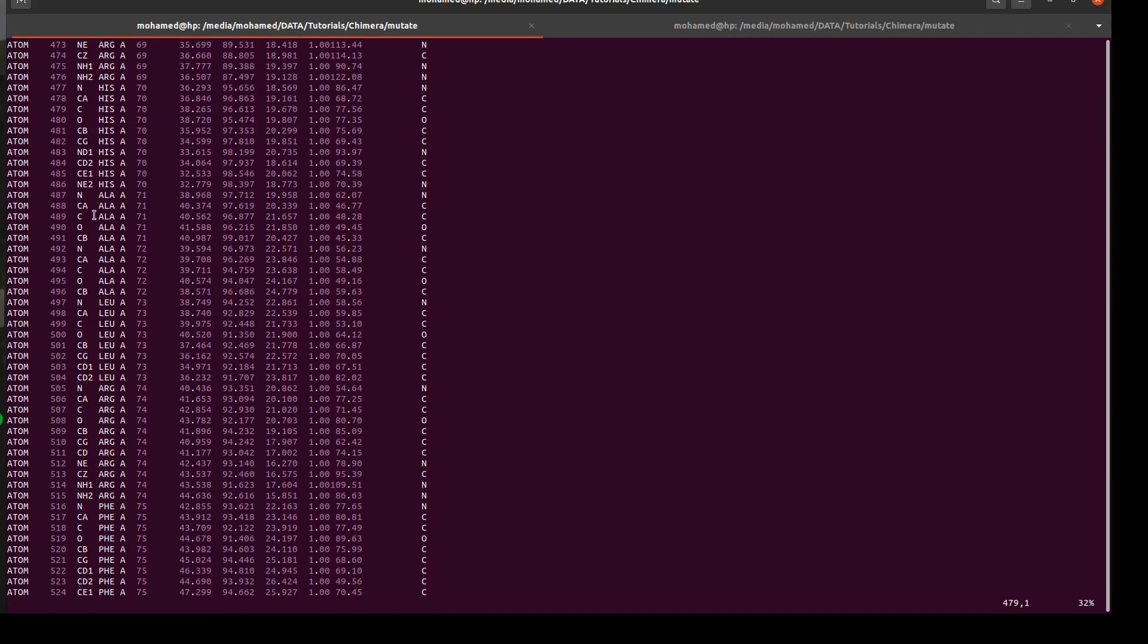And here was Ala. So you don't have to have the PSF file, and this is pretty easy. I like it because you can compare the clashes and different possibilities of the side chain. Sorry, we love VMD, but I started to like Chimera. That's the first video as a postdoc. I just started with a very simple thing to raise my energy to make more videos, but soon I'll upload more tutorials. I have a lot of ideas and energy now. Good luck learning. See you!